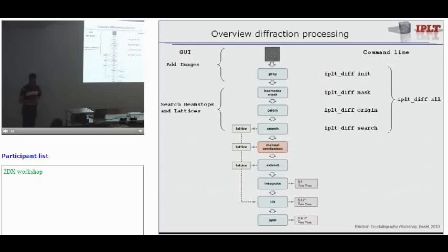So what we do is fit the background of inelastically scattered electrons and extrapolate that where there is the highest intensity in the inelastic scattered background, there should be the origin. So that's done to find the origin of the lattice.